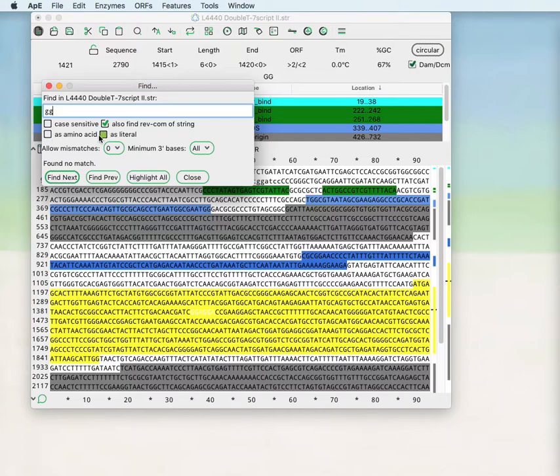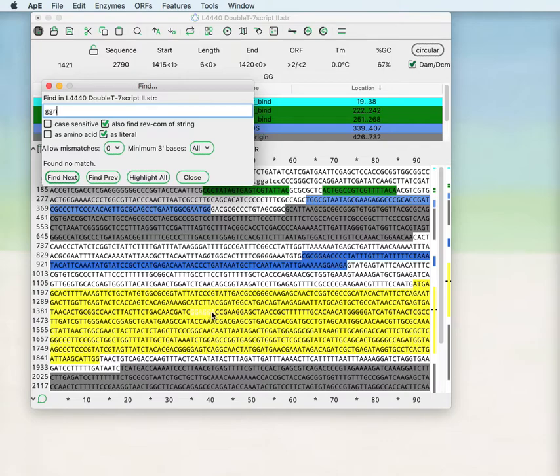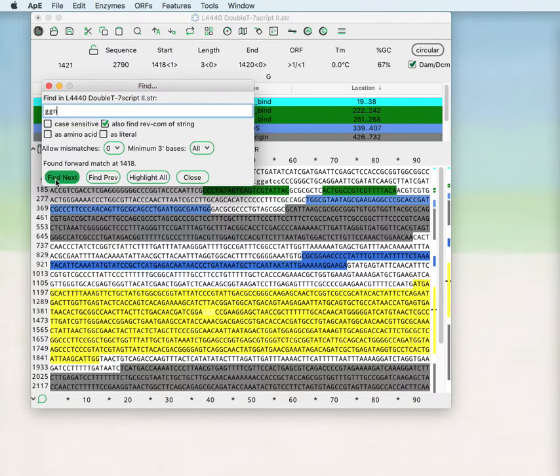If you ask find as literal you can search for ggn and it will only match when there is an actual base n in the sequence. Whereas if you do not ask for it to search literal, it will find the sequence with the IUPAC degeneracy code in the search.